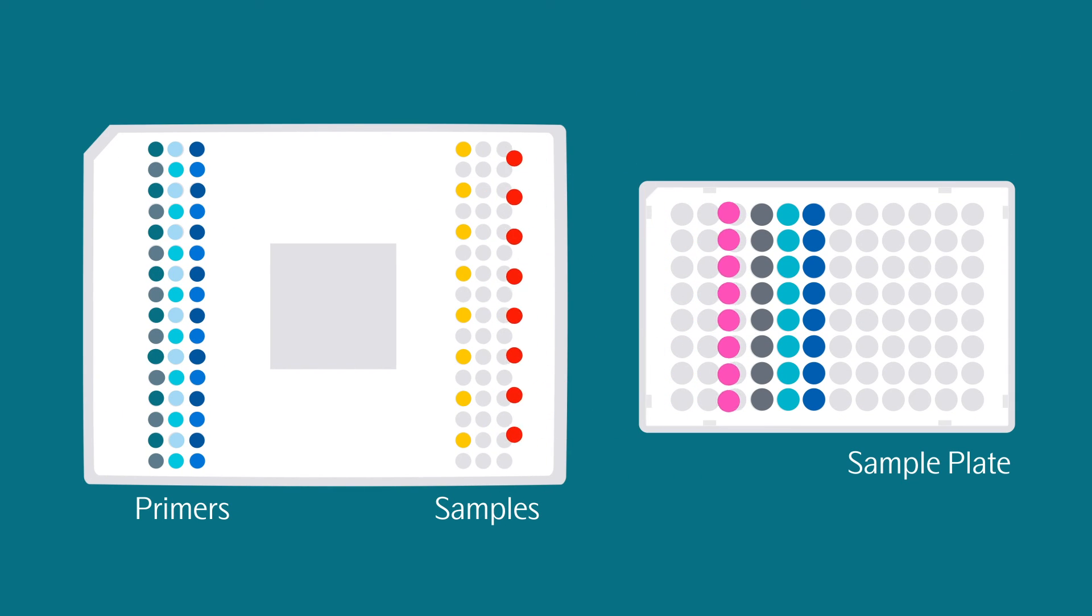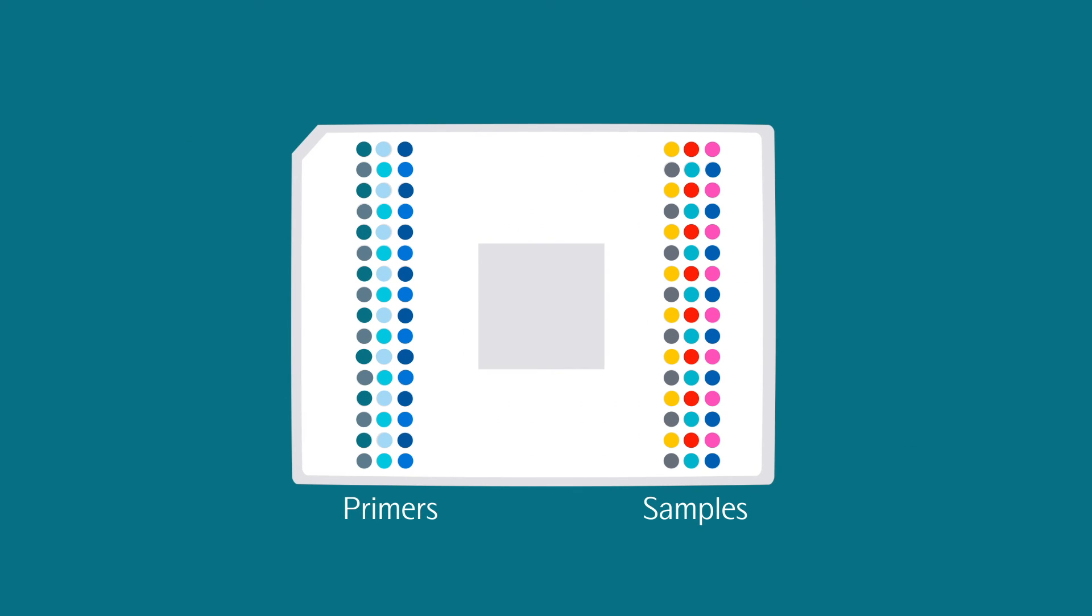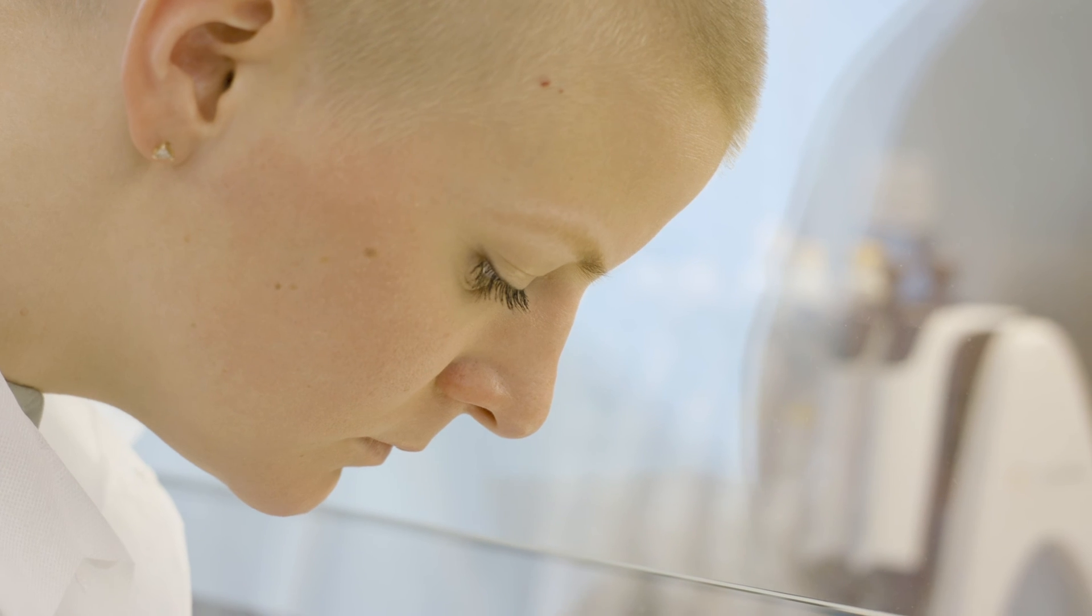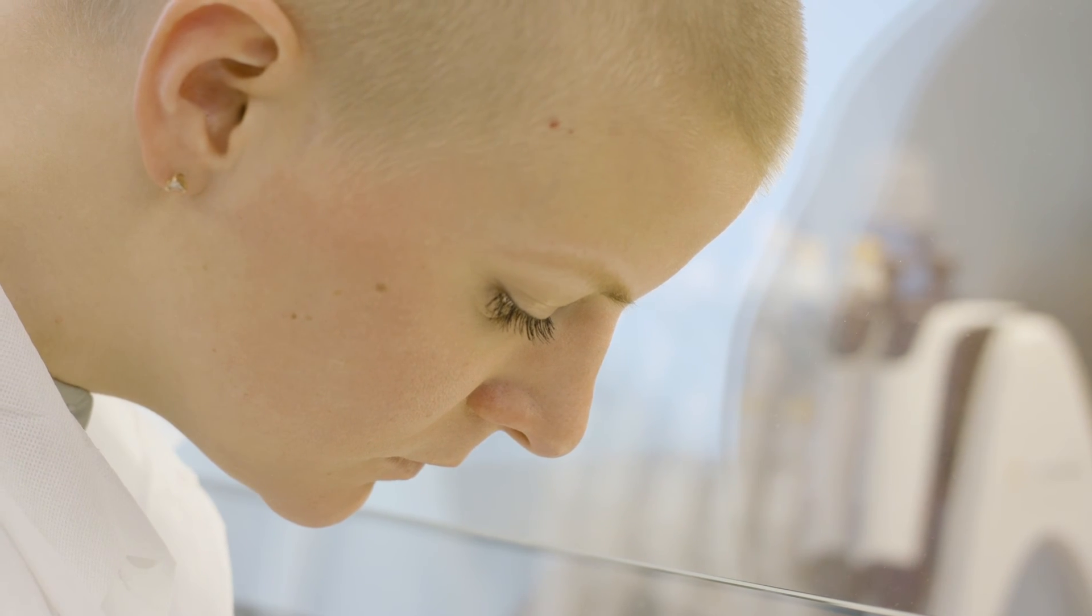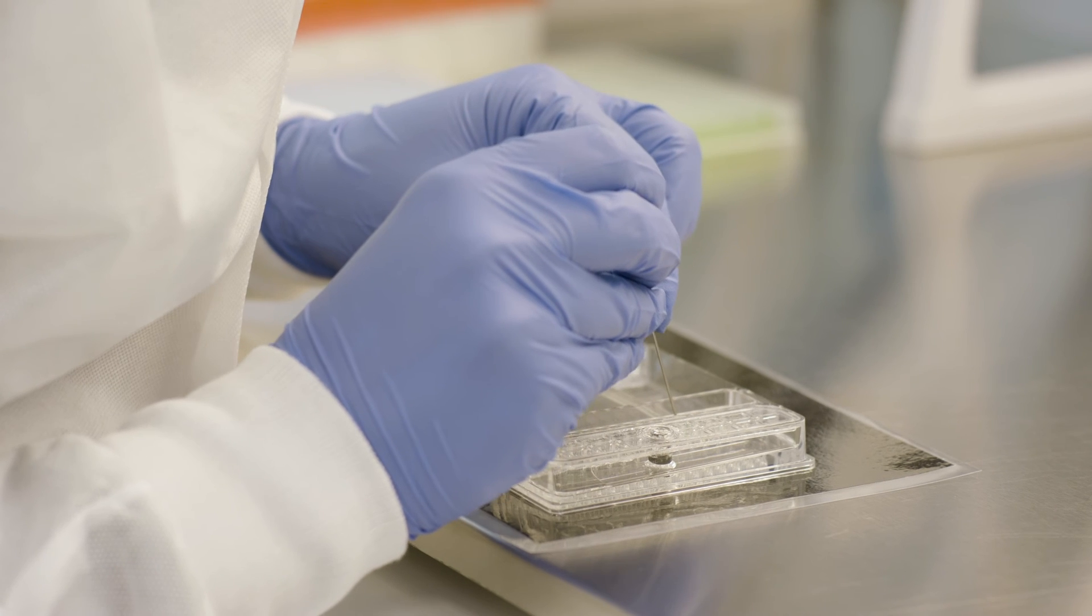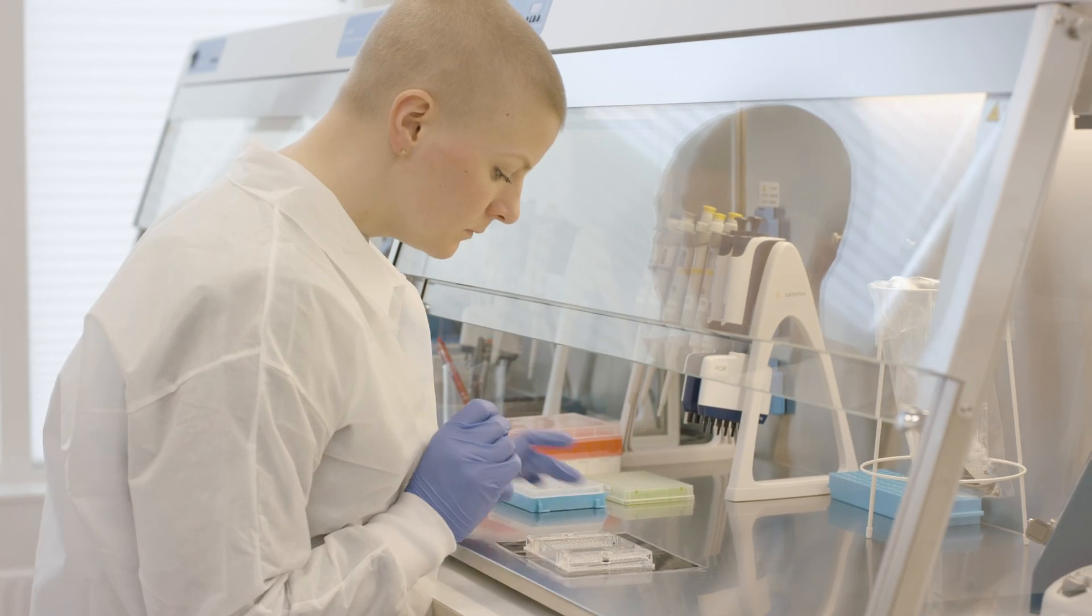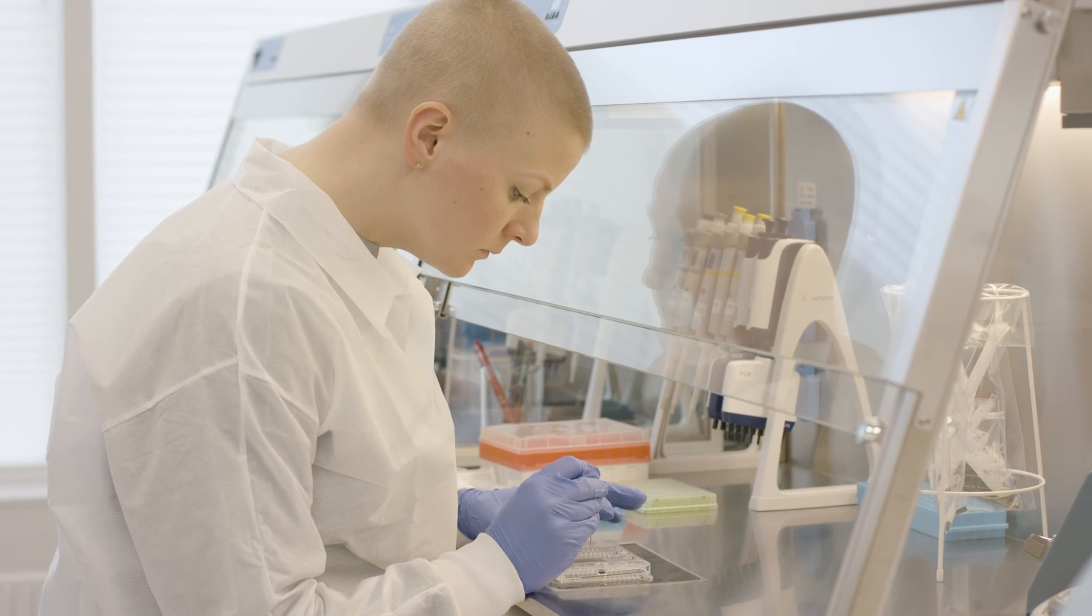Using reverse pipetting, pipette 5 microliters of each sample into the respective sample inlet on the IFC on the right-hand side. Carefully check for bubbles in both the wells for primers and samples before proceeding. If any bubbles are found, they should be removed using a syringe needle. Change needle between wells to avoid contamination.